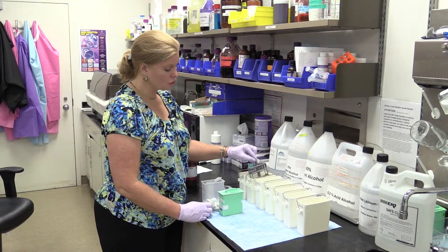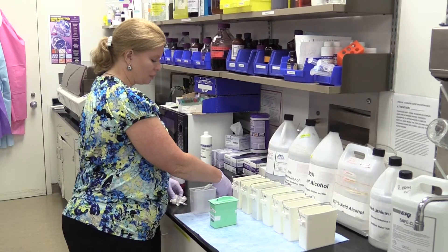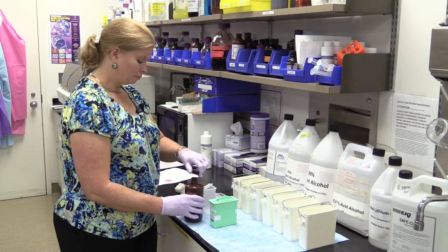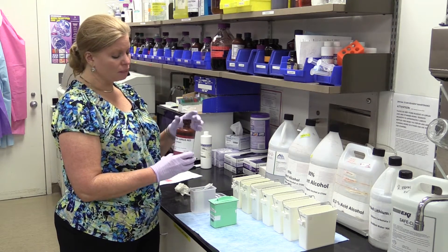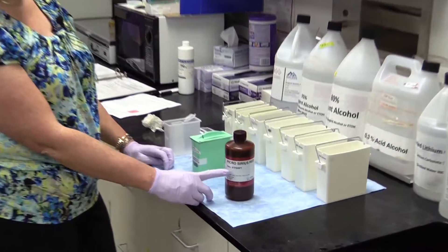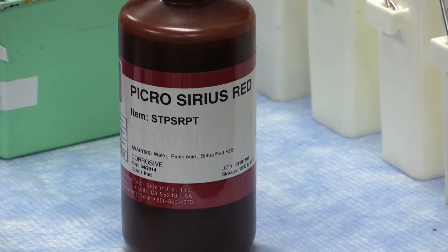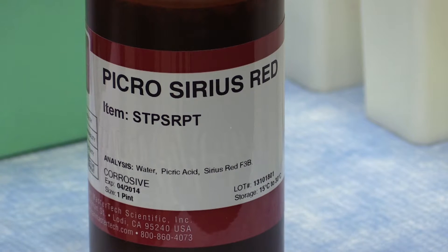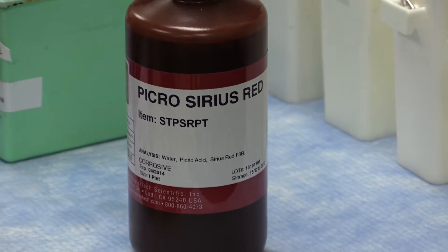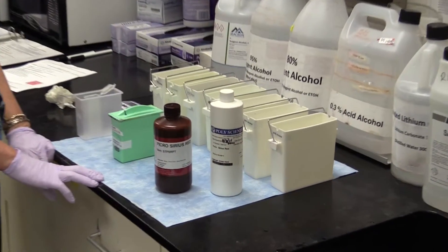I'm going into my next xylene substitute. Give it some agitation as we go into the next one, and give it another five minutes. Now I want you to notice something about the Picrosirius Red — make sure that you're getting Picrosirius Red and not just Sirius Red. The Picrosirius Red actually has picric acid in it. We like this brand American Master Tech — we feel like it birefringes beautifully and the overall stain is beautiful. We've also found that Poly Scientific has a pretty good Picrosirius Red, although we still prefer the American Master Tech brand.